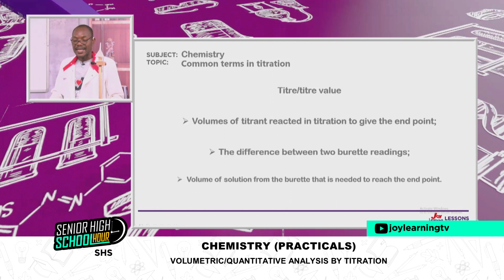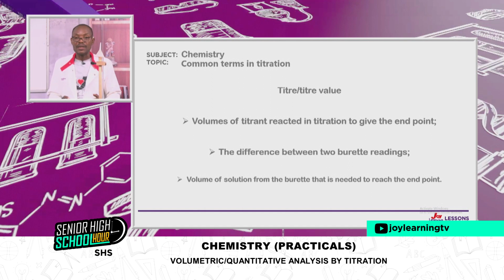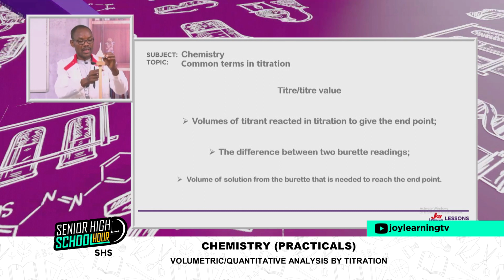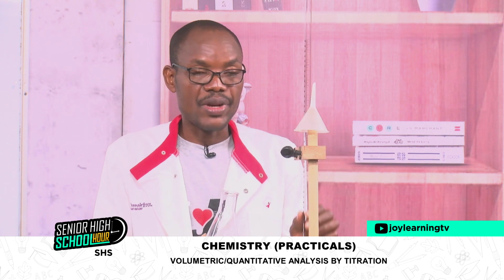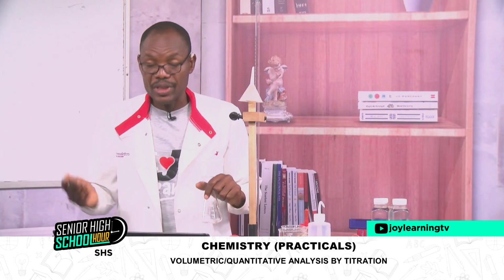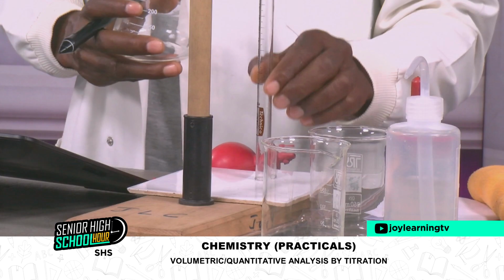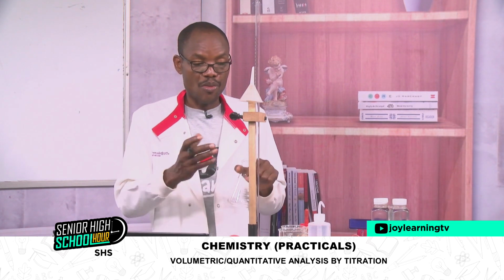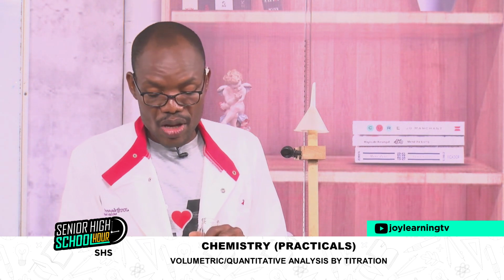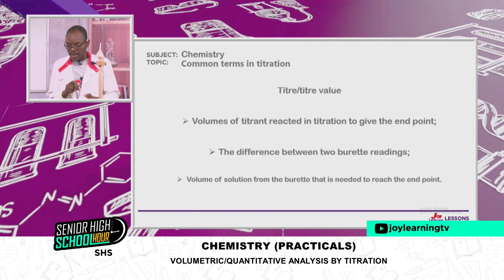Then we have the titer or the titer value. Volume of titrant reacted in a titration to give the endpoint. So as I said already, I'm running a solution in the burette into another solution in the conical flask, and I see a color change. That is the volume from the burette I need to develop the color change in the indicator used, or the difference between two burette readings. So if I start from 0.00, then I run the titration and I have a value of 18.00, then I take the difference. So 18.00 minus 0 will give me 18.00, and that gives me the titer value. Or I can say volume of solution from the burette that is needed to reach the endpoint.